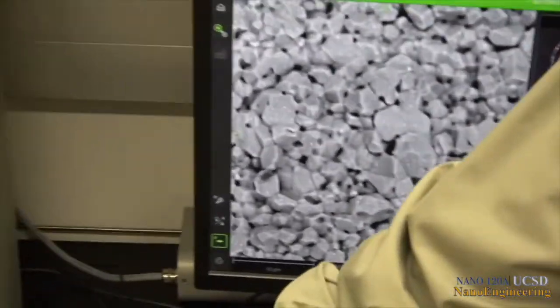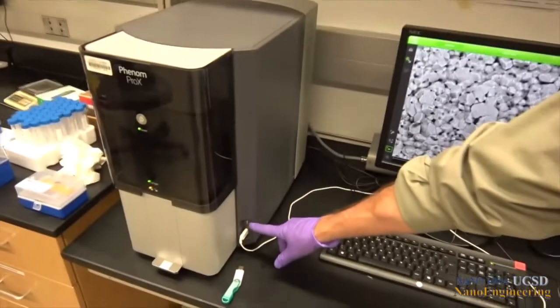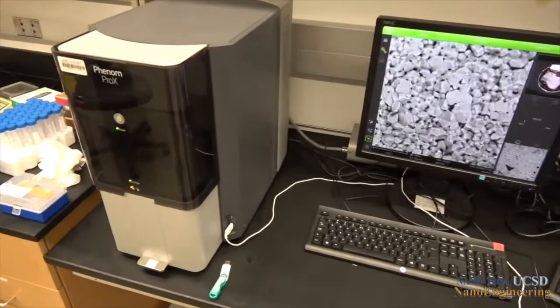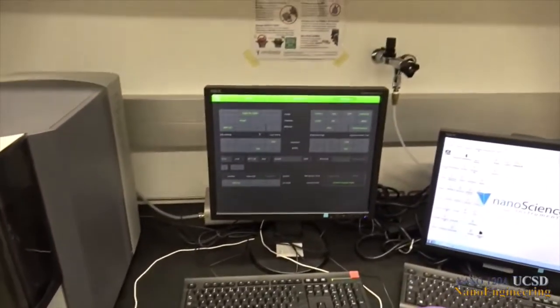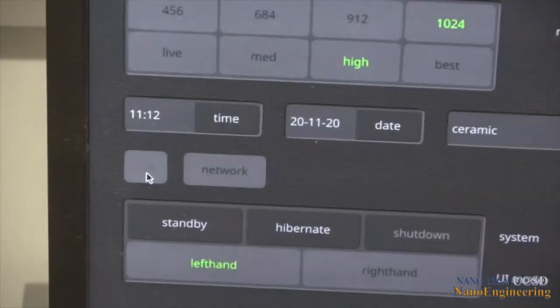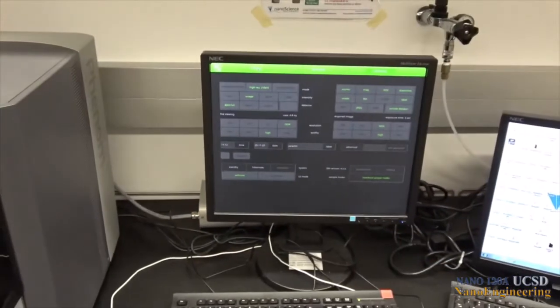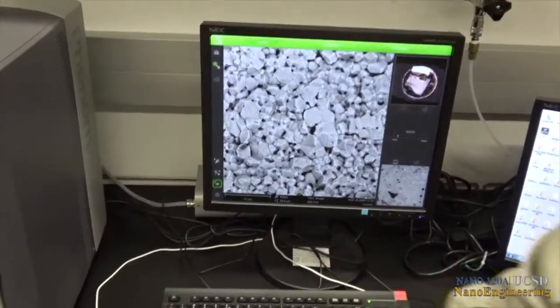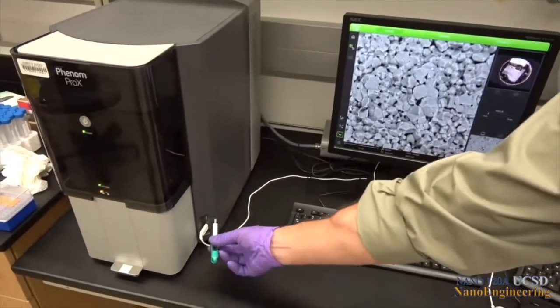Images can be captured on a memory stick or thumb drive. Before any pictures can be taken, it is first necessary to make sure that a device is connected to the USB port shown here on the console. When nothing is in this port, the camera icon on the screen will not appear and the icon labeled USB in the settings menu will also not appear.